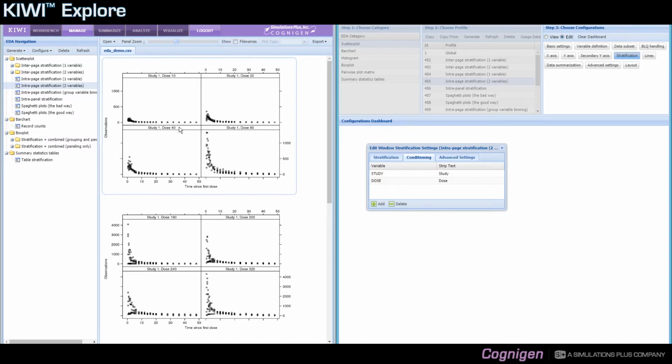Sometimes the values could be extremely large, and the text could be larger than the actual available space in the strip. In this case, you may want to display the information relative to each value on a separate line, and for that you need to go to the advanced setting and set the last field, multi-line strip, to true. So the default is false, so all the strip information is shown on a single line. Turning that to true will display this information on multiple lines.